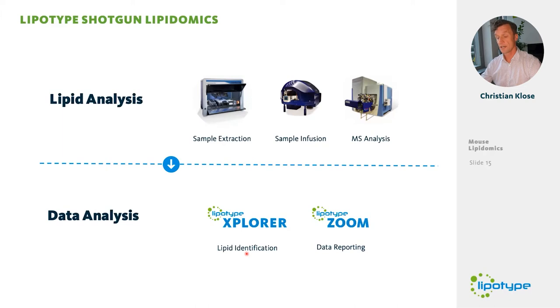It's a software based on a software called Lipid Explorer that was developed in the lab of Andrei Shevchenko at the Max Planck Institute here in Dresden. And we have taken up this software and tailored it to our needs, to our platform, in order to make it really capable of dealing with high throughput projects and large numbers of samples.